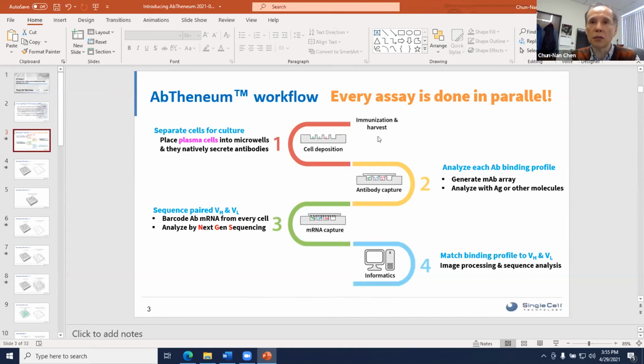But we recently acquired a flow cytometer, a cell sorter. And so we're looking into some other types of mostly non-lineage markers that would allow us to select for cells that are secreting antibodies. So regardless of CD138, we want to just find cells that are secreting antibodies. We have some ways of doing that. When we get that done, I think whatever number of cells we obtain, a vast majority of them will be secreting antibodies. So right now, I think we're constrained by the marker that we use for selecting plasma cells.